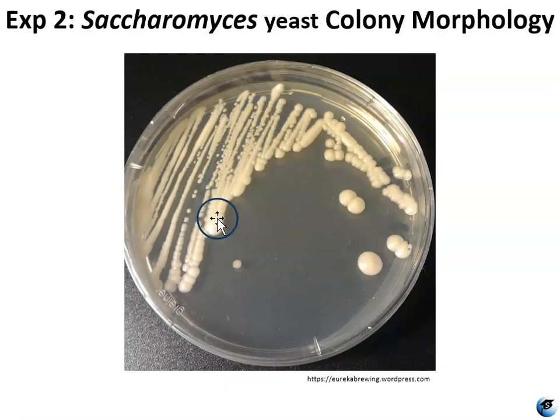It's got a nice off-white color to it. It's raised. It's pretty large. It's shiny, and shiny is a technical term. Shiny means that it reflects light, whereas dull means that it doesn't reflect light.